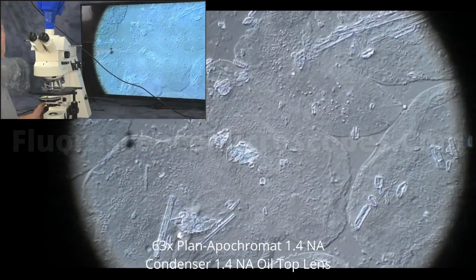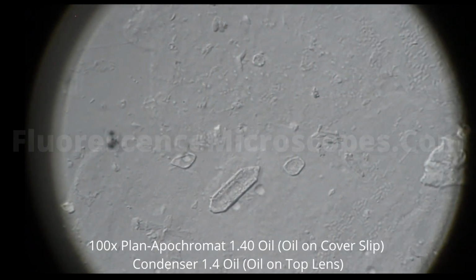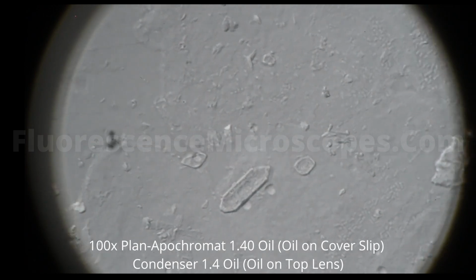Okay, 63x objective oil. Now we're on a Plan-Apochromat 1.4 numerical aperture, and we're looking at epithelial cheek cells under DIC.